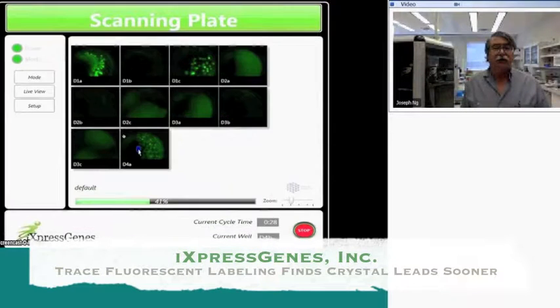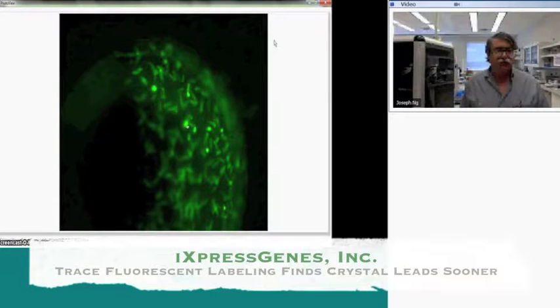These are rod-shaped crystals. I can tell that because we're getting higher fluorescence on the ends. It's a light pipe effect that we get from rod-shaped crystals. And here is the last one that we're blowing up on. And then we're not going to see this last one because that ends this demonstration.